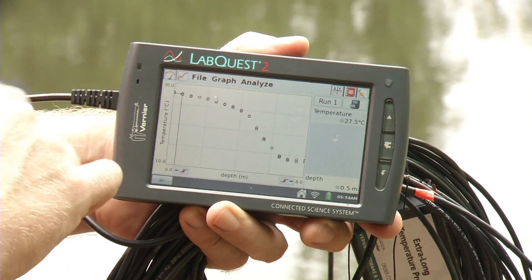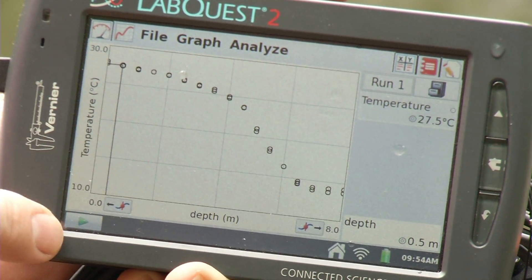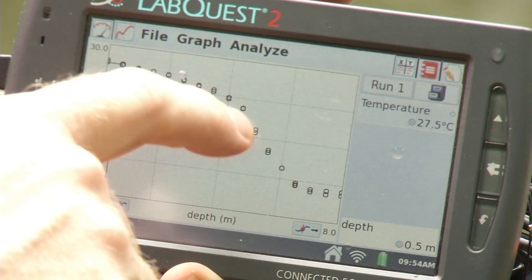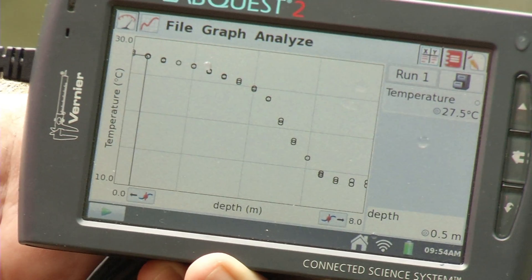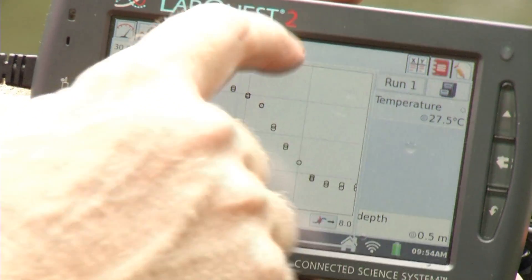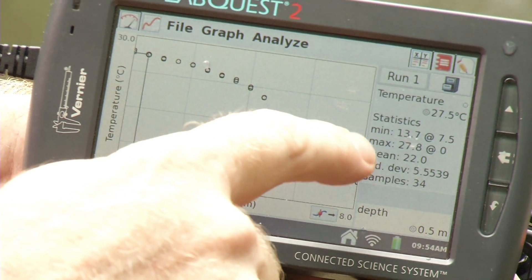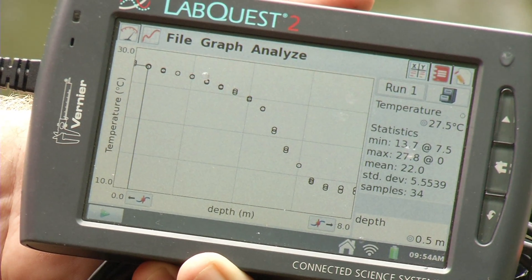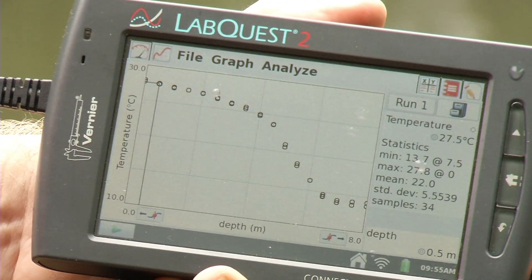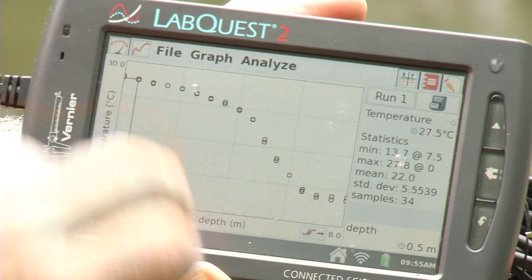Back on land, we can look at our data — there's the temperature profile of the pond. The scale runs from about 10 to 30 degrees C. Towards the surface, temperature stays fairly constant, then it starts to drop off, and near the bottom of the pond it levels off again. I'll go under Analyze and check Statistics for temperature. The minimum temperature was 13.7 degrees C at 7.5 meters, and the maximum was 27.8 degrees C. The LabQuest 2 is splash resistant, so a little water on the screen won't hurt it, but avoid getting water in the ports.